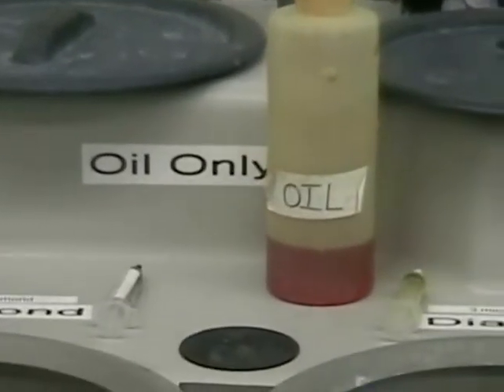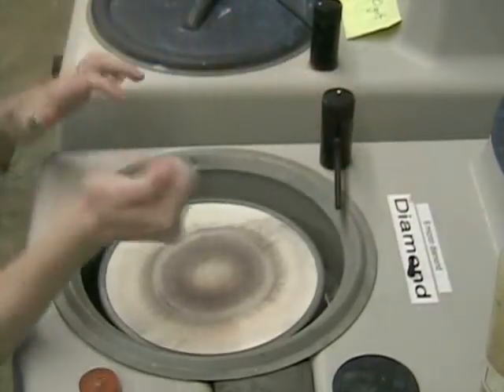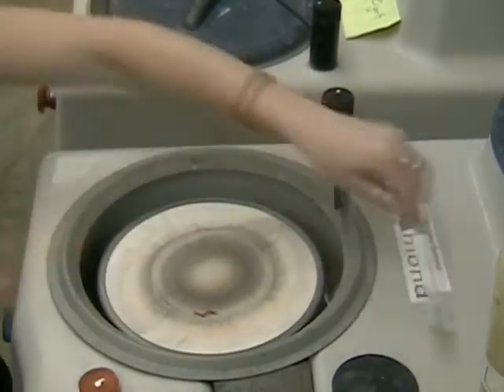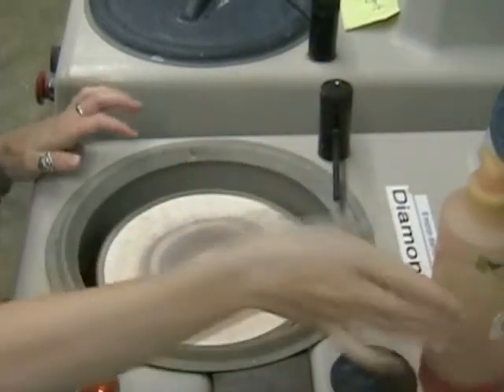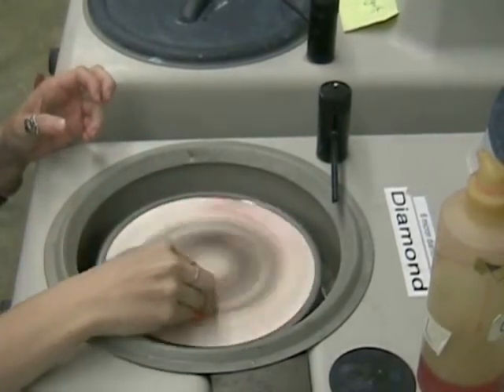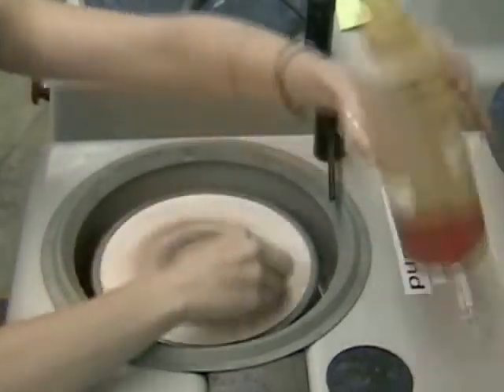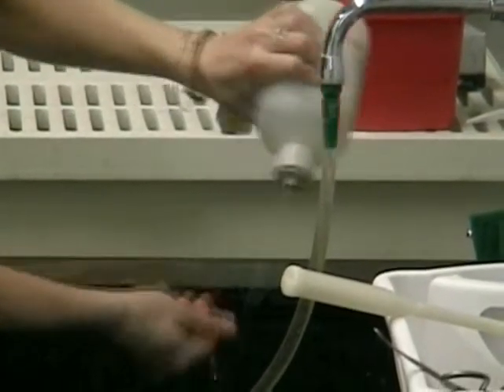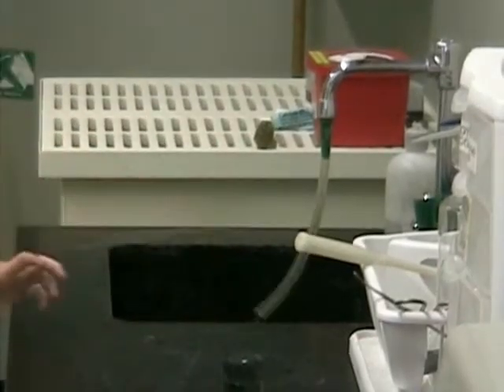After finishing the 800 grit wheel, move on to the diamond wheels. You have to use oil on these wheels because the diamond paste is water soluble. This is the 6 micron diamond wheel. Apply the diamond paste directly to the wheel, then add oil for lubricant and start the wheel spinning. For the diamond wheels you don't hold the sample in one place as you would for the silicon carbide wheel — you move it counter to the direction of rotation. Add more oil if necessary, and rinse off with soapy water when done.